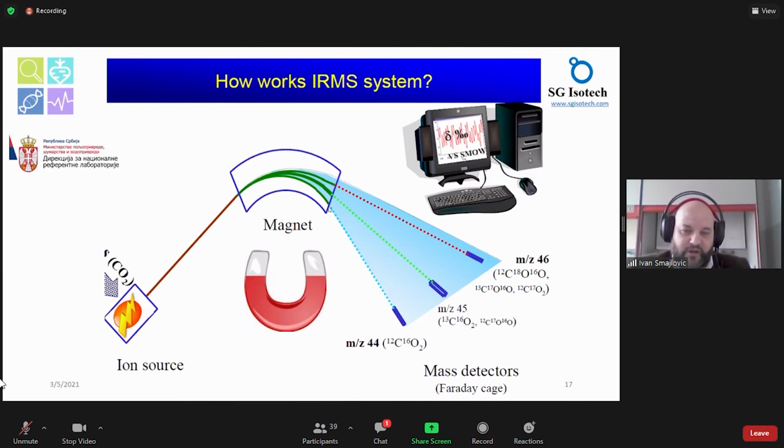But if you want to measure hydrogen stable isotopes, there are also 2 more cups, if you look at the tip of the pointer, one is here and one is here. One will measure hydrogen, the other will measure deuterium. So in that way, we will get mass 3 and mass 2. And by relative ratio, the software calculates and gives you the relative ratio of the specific fraction. And then it calculates the delta D value directly from the software, from the option you choose.